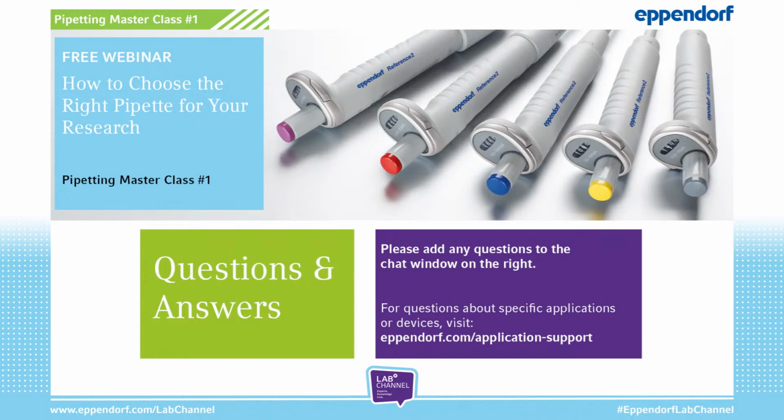Okay, so thanks for this question. As already mentioned in the webinar, we have 2 different operating or functional principles. We have the air cushion principle for aqueous solutions and the positive displacement system for challenging liquids. And in general, you can say that the highest accuracy and also reproducibility can usually be achieved with positive displacement pipettes or dispensers, especially when you're working with challenging liquids.